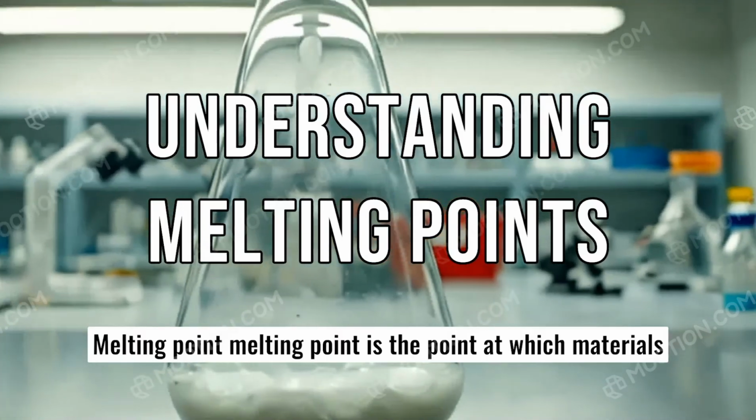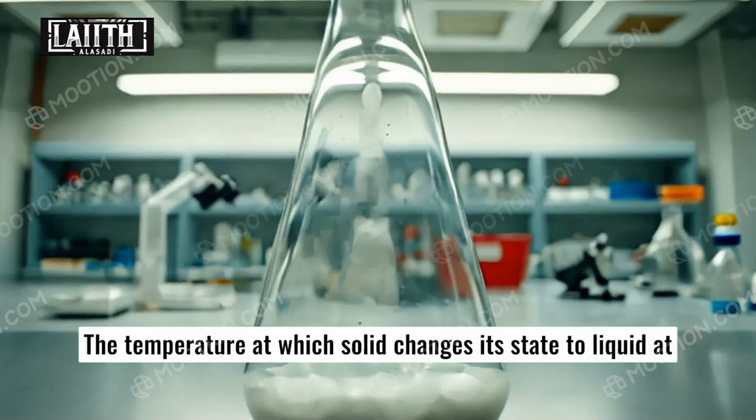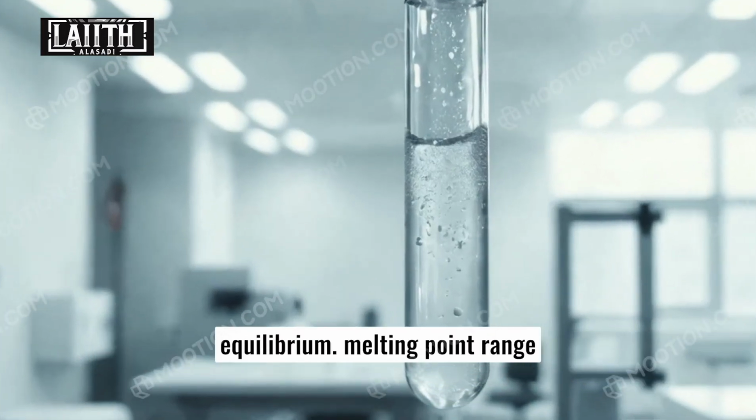Melting point is the point at which a material changes from a solid to a liquid state. The temperature at which a solid changes its state to liquid at atmospheric pressure is called the melting point of that liquid. The point at which both liquid and solid phases exist at equilibrium.